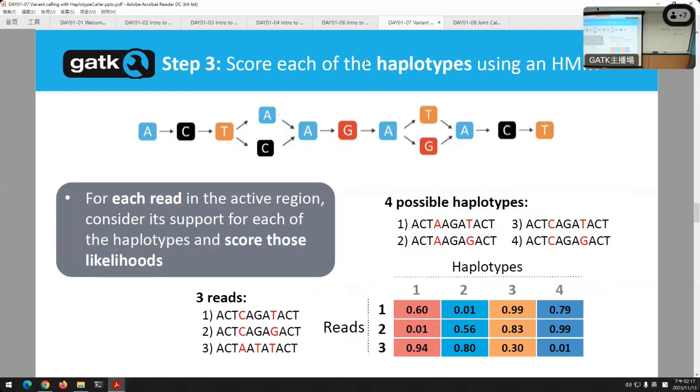Notice the red. I can be on the number 1, I have an A and a T. That's the reference. Okay? These are the possible ways I can go through the graph from the start to the finish. There's 4 ways I can go. Top and top, top and down. That's 2. I can go down and up, and then down and down. There's 4 ways. Now, that doesn't mean that every possible haplotype is seen in the reads. But that's the 4 possibilities.